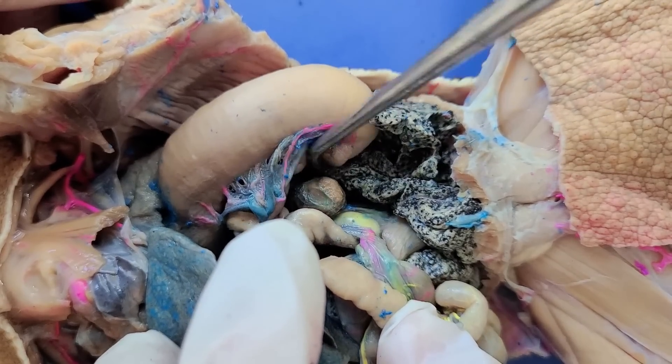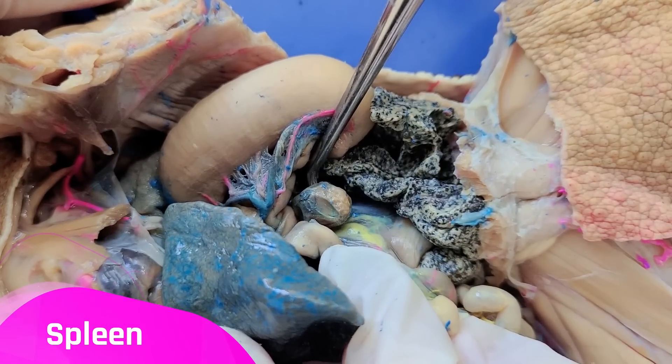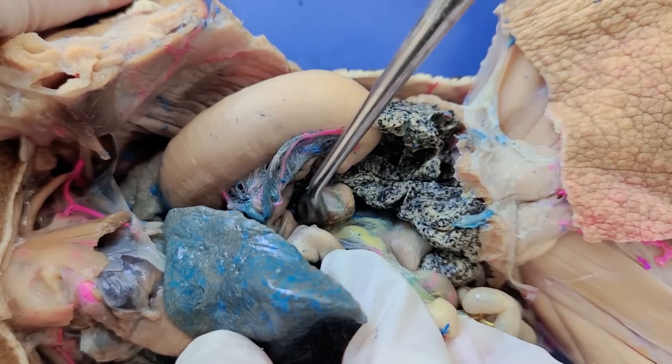Right next to the stomach, this round structure here is the spleen, which makes and stores blood cells and also destroys them if necessary.